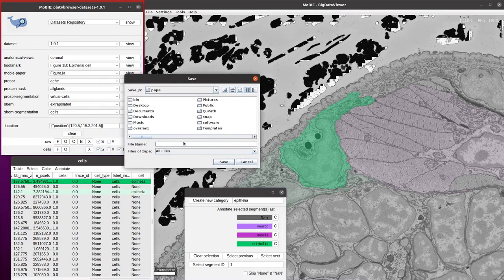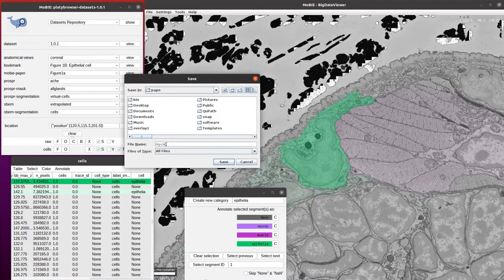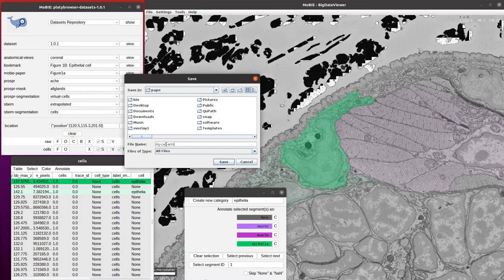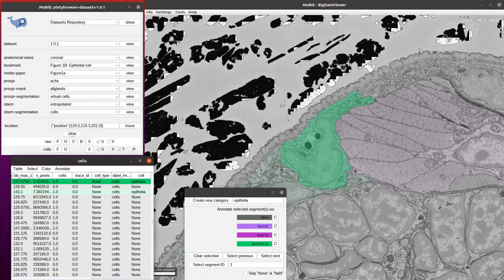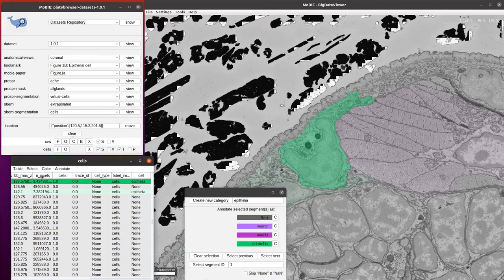Then you have to find somewhere to save it and give it a name. In this case, we're just going to call it mycellannotations.tsv for tab-separated values, and that will save the table with all of your annotations.